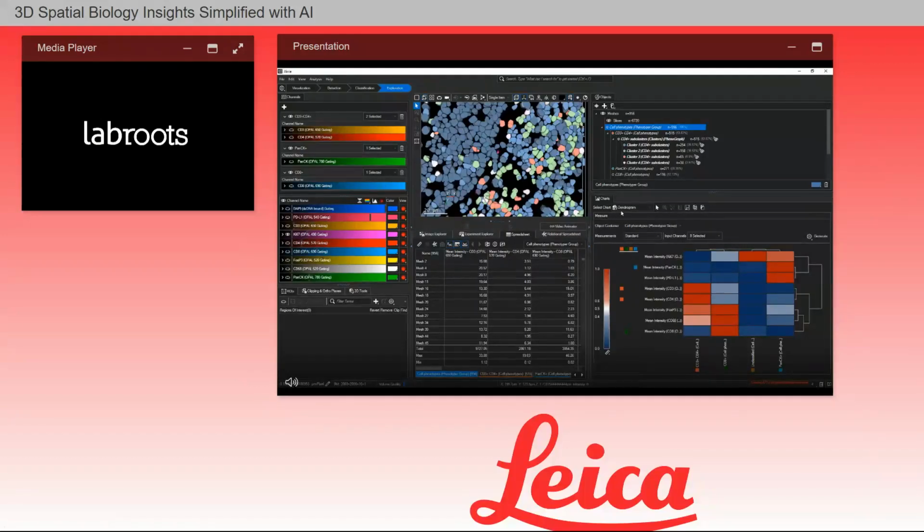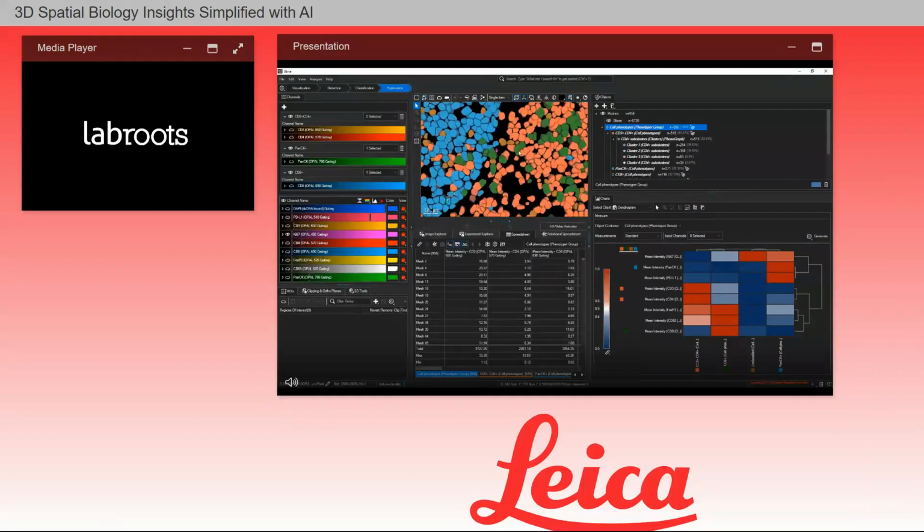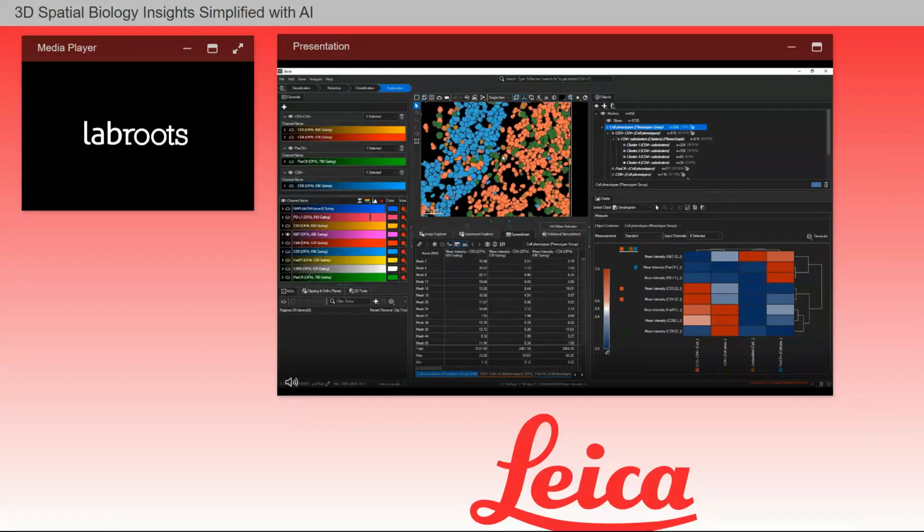Let's take our analysis one step further. I am going to spotlight my cell phenotypes group. Say I want to look at the infiltration of immune cells into the epithelium, or in this case, CD3, CD4 positive cells into the pan-CK positive cells.